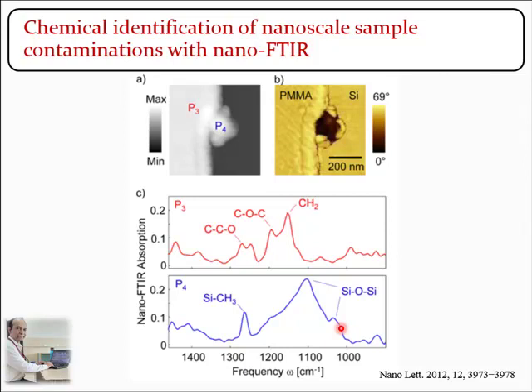Thus, we come to an end of this IR spectroscopy. Hope you come to know about the basics of IR, its principle, characterization and application. Let's have the hands-on training of the actual synthesis of the nanomaterials and its analysis using IR spectrometer.